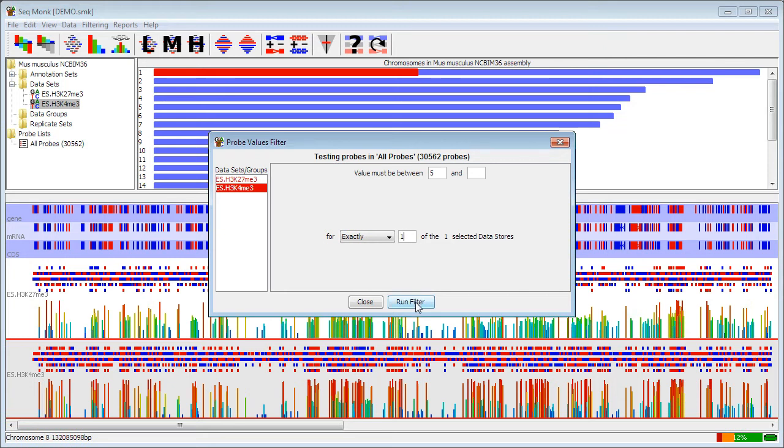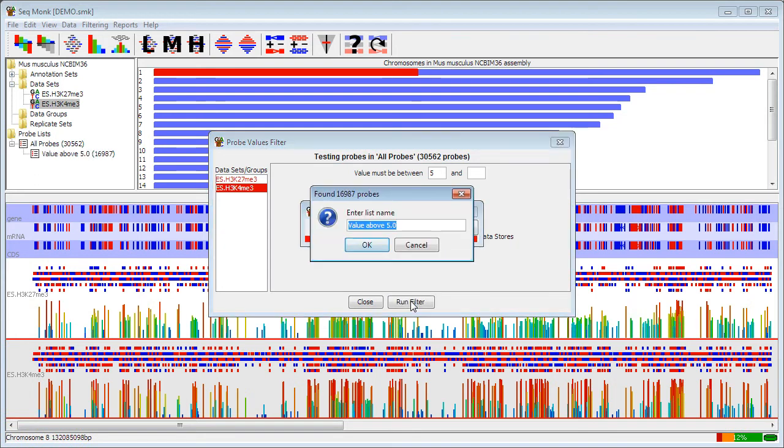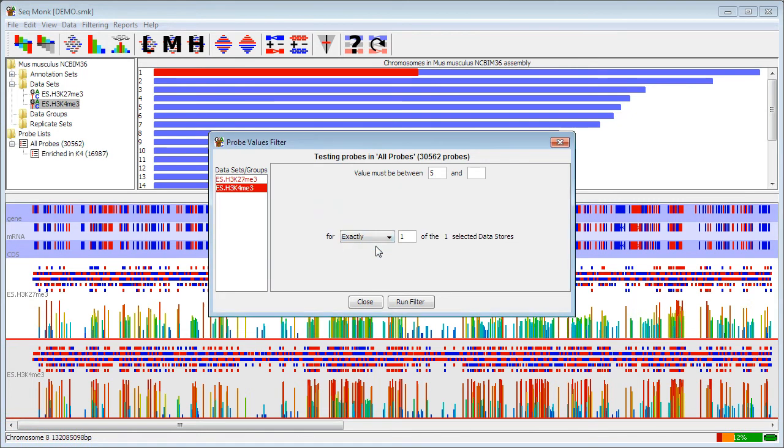You can see in the filter description at the top, it's telling me which probe list I'm starting from, in this case all probes, and how many probes are in there. I run the filter and it says that it's found nearly 17,000 probes. It will automatically make up a name for the list, but I can change that either here or afterwards. If I say OK to this, the box will stay open, but my new list will now appear in my list of probe lists.